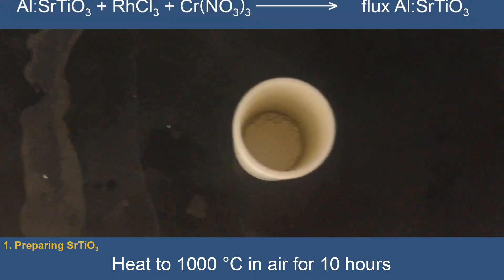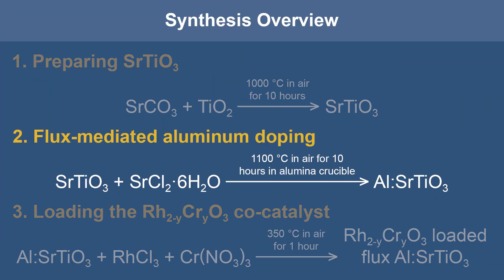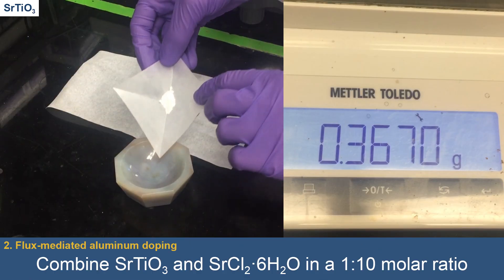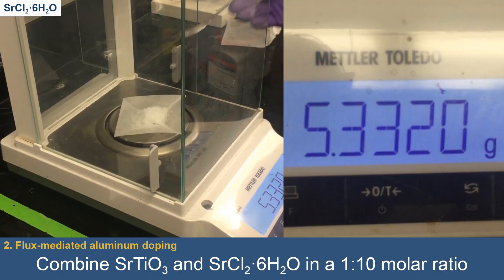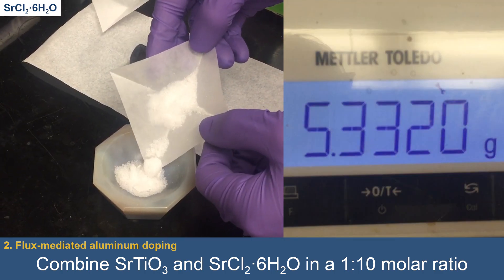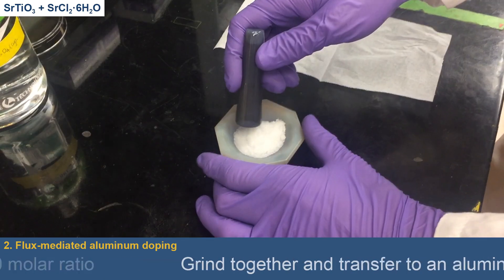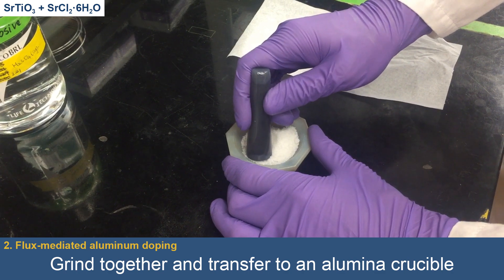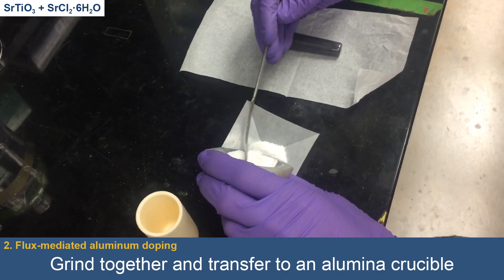Now we'll continue with the aluminum doping and washing procedure. The strontium-titanate powder is combined with strontium-chloride hexahydrate in a 1-to-10 molar ratio. The strontium-chloride hexahydrate will act as a flux between the strontium-titanate powder and an alumina crucible. The powders are ground together with a mortar and pestle, and the mixture is then transferred into the alumina crucible.